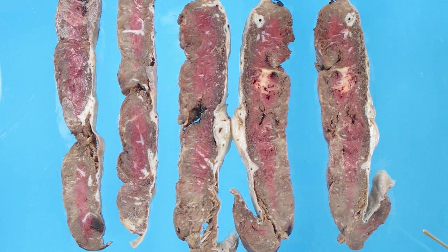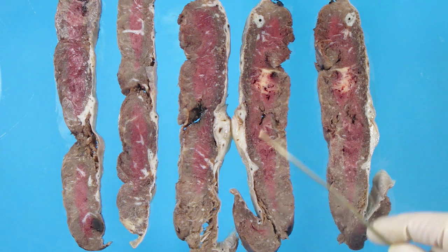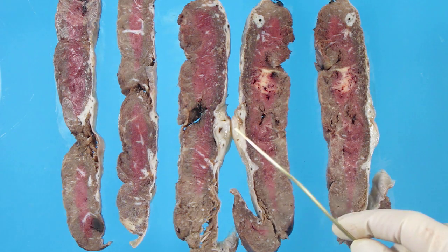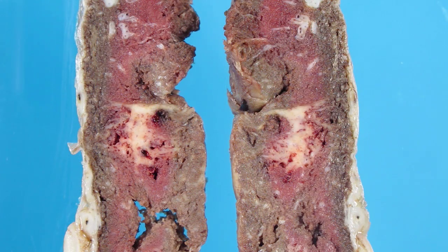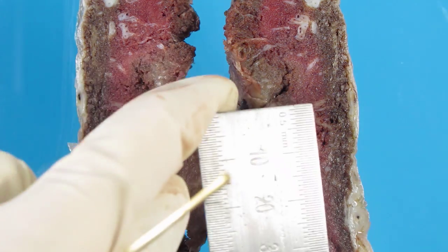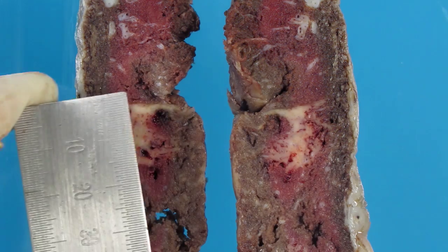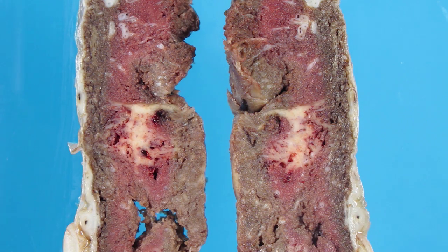We have laid out some of these separated pieces in which there are lesions. There are the white firm areas here with focal hemorrhage. This is the cord insertion site. There is a peripheral infarct here and a small hemorrhage here. Any lesions such as an infarct should be measured so you have some idea of their measurement. Measure them in greatest extent. Another factor is to estimate what percentage of the placental volume is involved by infarcts.